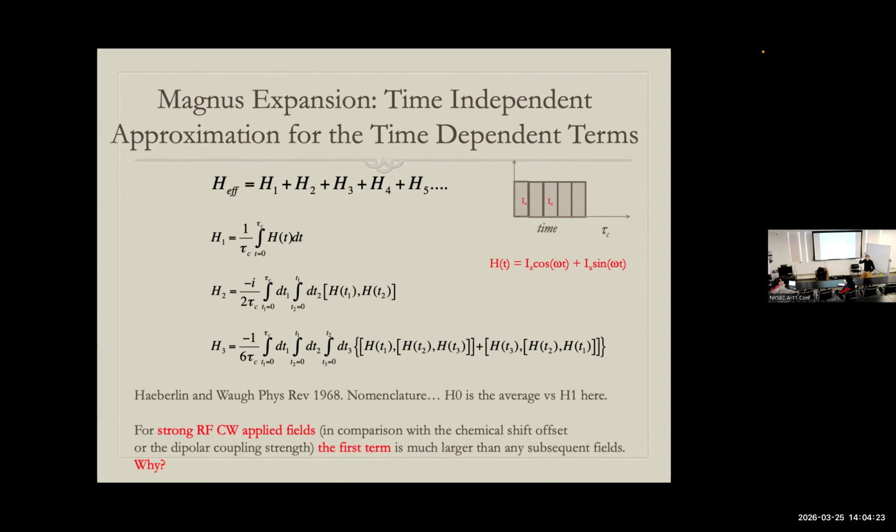Well, not very far. If the RF is really strong, that's a short cycle time compared to evolution. So you're just moving your R naught just a little bit. That's a good convergent limit. It always is. Small angle could be convergent.